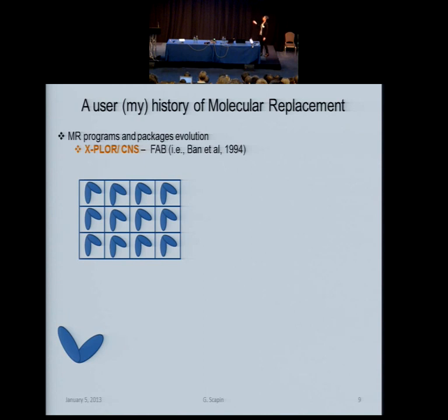If you have your unknown FAB and a search model, the relative angle between the 2 domains is probably not the same. So you can get a series of rotations that tend to match the individual domains, but they are very low level, and it's really hard to define, among all these rotations, the one that will actually give us a correct translation.